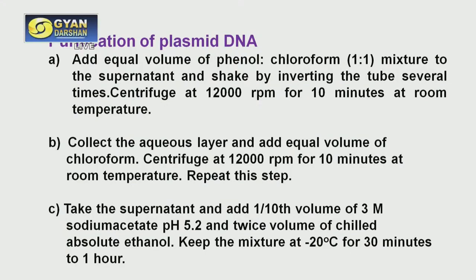How will you do it? You have to first equilibrate the phenol in such a fashion that the pH is 8.